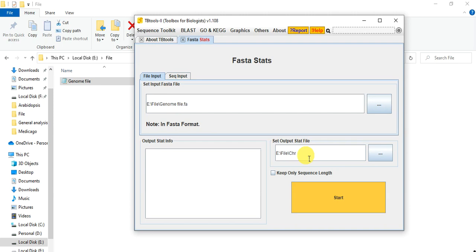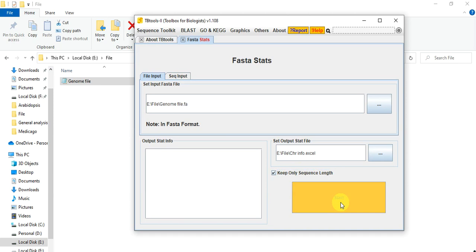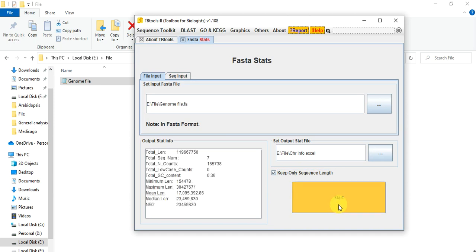Set output stat file that your output statistics of gene information or other where it saved. So give the name like chromosome info and here you can find Excel file that our information will be saved in Excel format. And here keep only sequence length means that you need only sequence length of each chromosome. We need only sequence file information means each chromosome length and click on start.